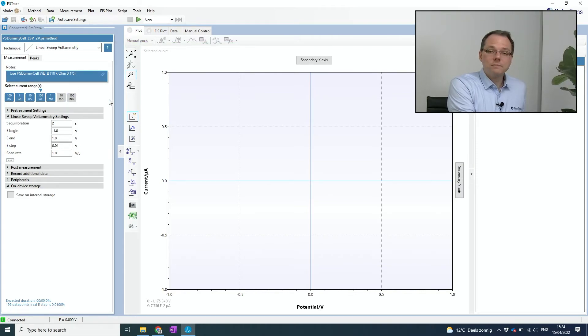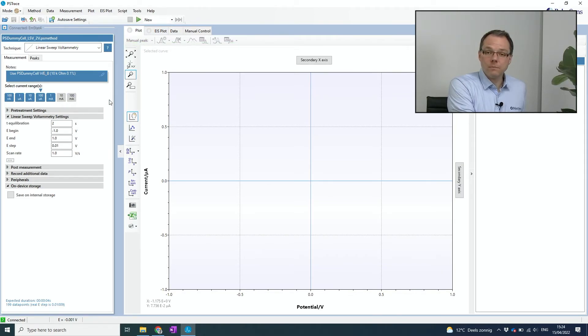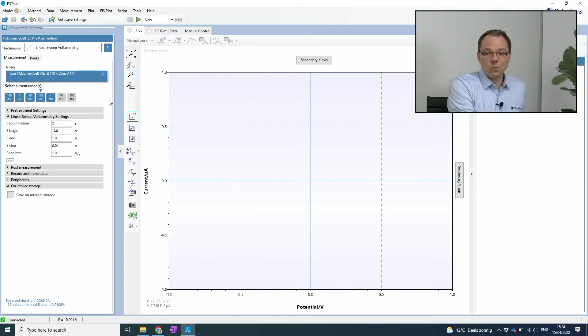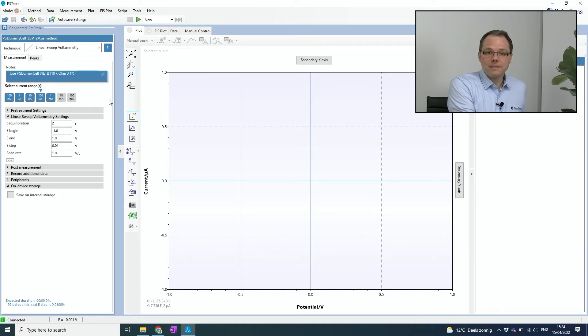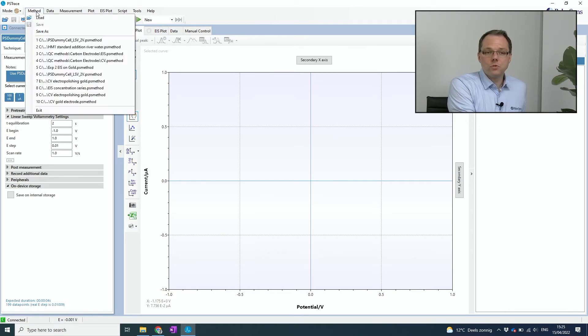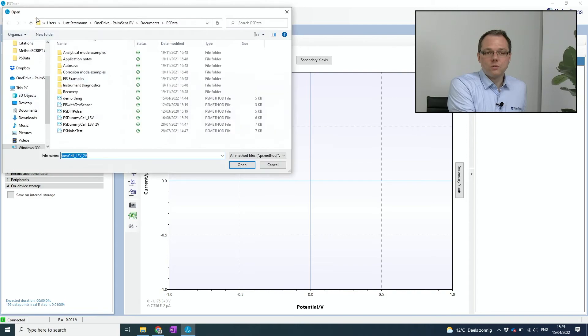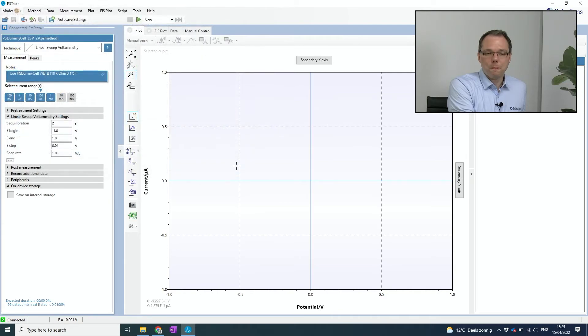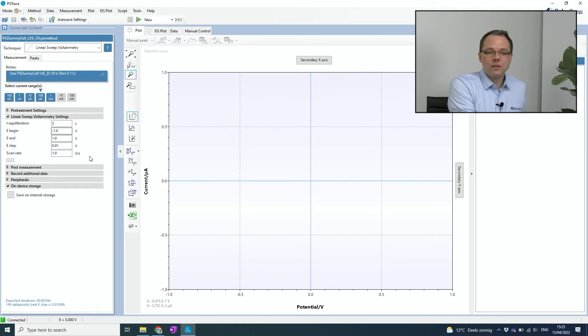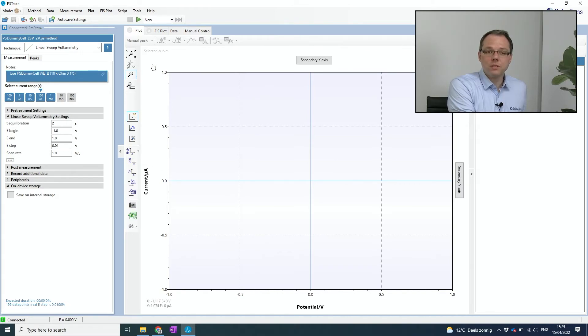As a first measurement, I want to perform a linear sweep voltammetry on my 10 kilohm resistor. I can set the parameters myself if I want to, but there's also the option to load a method file. So I can just go to method, load, and then I select the method file that I want to use. So now it has loaded the parameters that I want to use for this measurement. So I just need to press run.